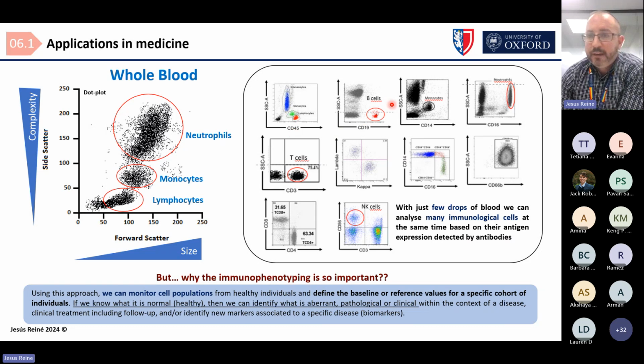The same thing happens with different markers from different populations. We don't need to go into detail, but essentially I would like to explain how this works more or less. We have different markers. For example, CD19 is a marker of B cells. Most of the markers have a CD, which means cluster of differentiation. When antibodies against these populations were characterized, they were defined in a very specific workshop, and they called them CD1, CD2, and every CD represents a specific antigen recognition.